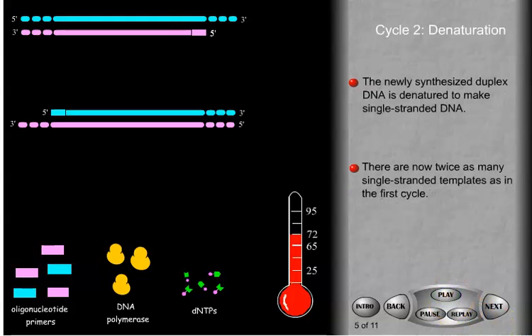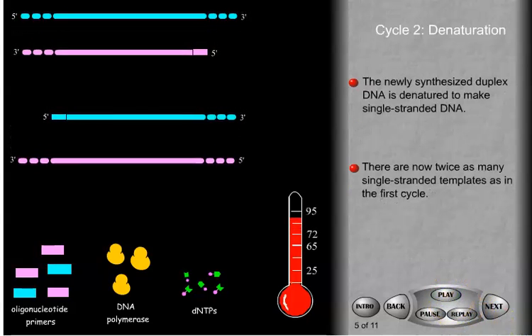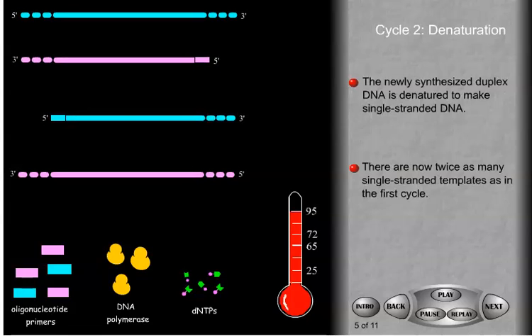In subsequent cycles, the denaturation, annealing, and extension steps are repeated over and over again. At the start of the second cycle, there are now twice as many strands of DNA to act as templates. Half of them end with one of the synthetic oligonucleotides in the reaction mixture.